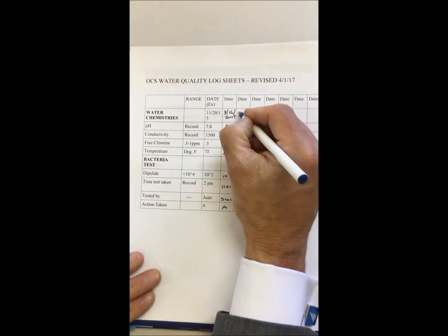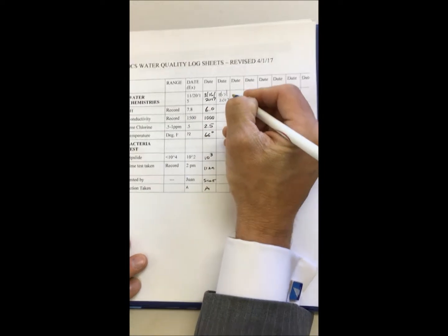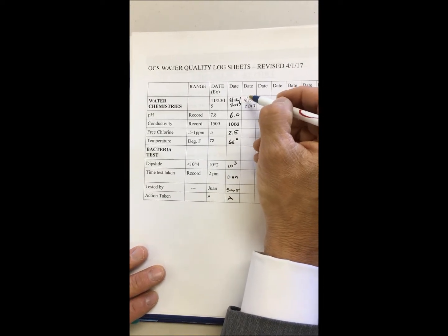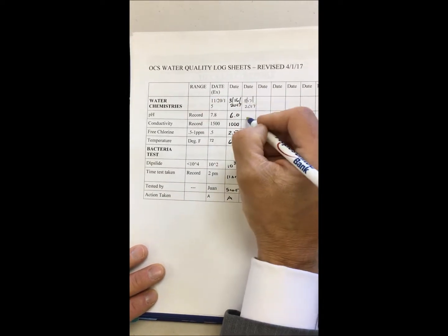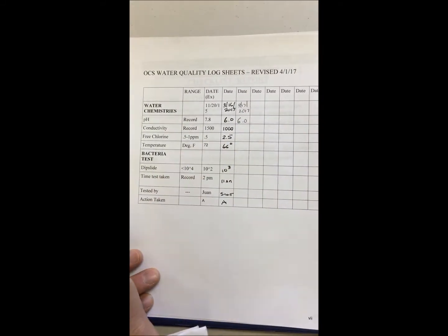So when we go right to the log sheet itself, today we did a test, so today we're going to call it 3/17. Make sure you put the full date. Don't just put 3/17. They'll think you mean March 2017. It has to be a specific month, day, and year. Before we get a pH of 6.0, so I'd record that 6.0 in there. I'm recording it. There's nothing to do about it.